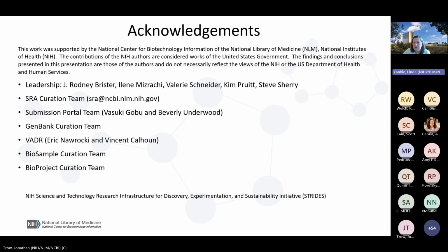Vince, can you provide more information to answer Curtis's question regarding VADR and the models? The HSV1 model is only against HSV1. If you have human ORFs inserted, it will not be able to recognize those, and it'll probably report them as an error and fail them. So no, it cannot pull from more than one reference at a time. And there are no human references in the VADR model database.